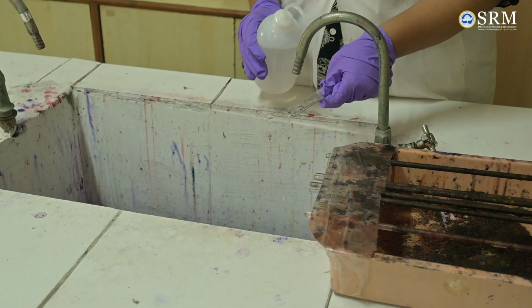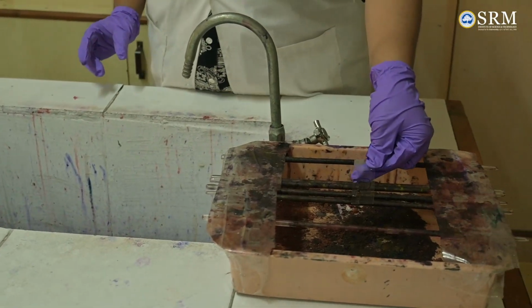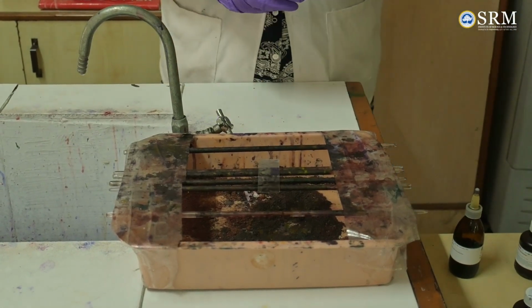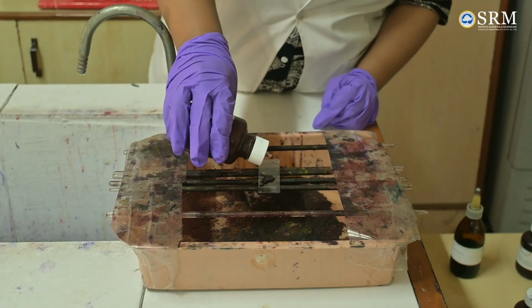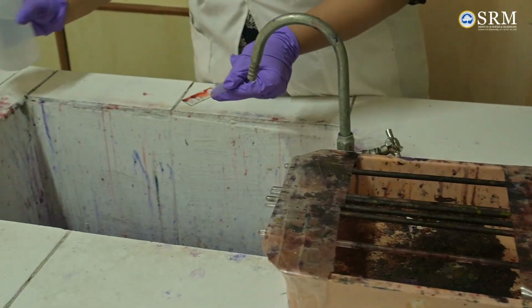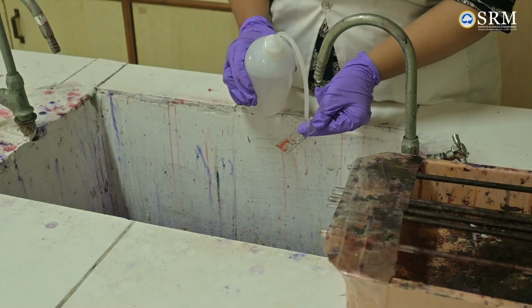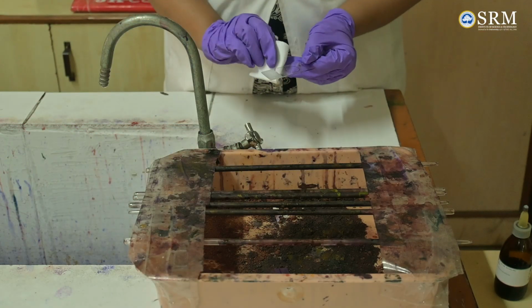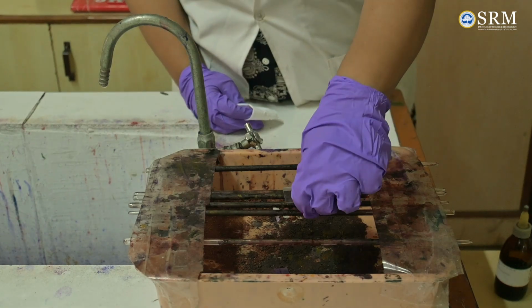And then we move forward towards our fourth stain, for which we use Safranin. It is our counterstain. We add a few drops of the Safranin on the smear and let it sit undisturbed for 1 minute. After 1 minute is over, we wash off the stain with distilled water. And now we use a blotting paper to remove excess water around the smear and let the slide air dry until the water is evaporated.